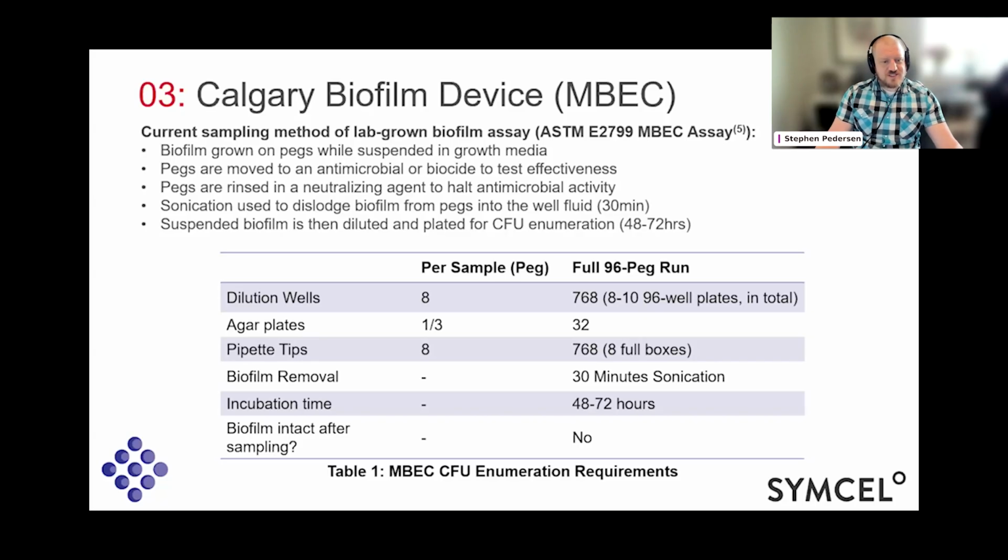There's the 30-minute sonication step we talked about, a 2 to 3 day incubation time and an incubator in the lab. And after all of that, your biofilm is no longer intact. It's been removed and plated, and it's gone.